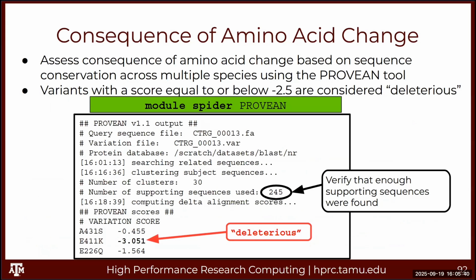This is not supported anymore, but it's a really useful tool. There might be newer tools now that use GPUs and are a lot quicker. Basically, this takes a lot of organisms, aligns them, and looks at the conservation of the sequence. If it's in a well-conserved region, which means it's very critical for function of life, and there's a mutation there, chances are it's going to cause some effect on the viability of your sample, or maybe it's making it more infectious or something.